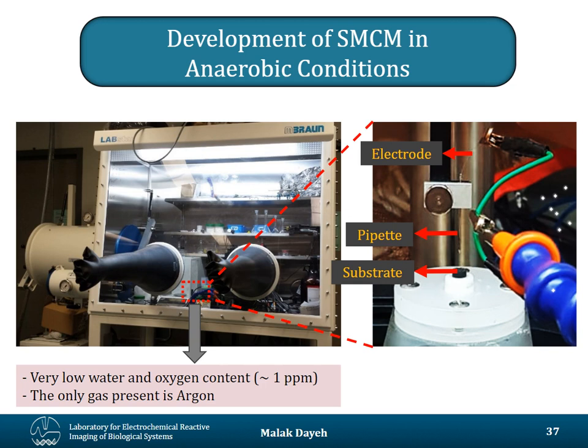But there are very few experiments you can carry out with aqueous electrolytes for batteries. So if your field is battery research and you're thinking about doing such measurements, you have to think about putting the entire system in a glove box.